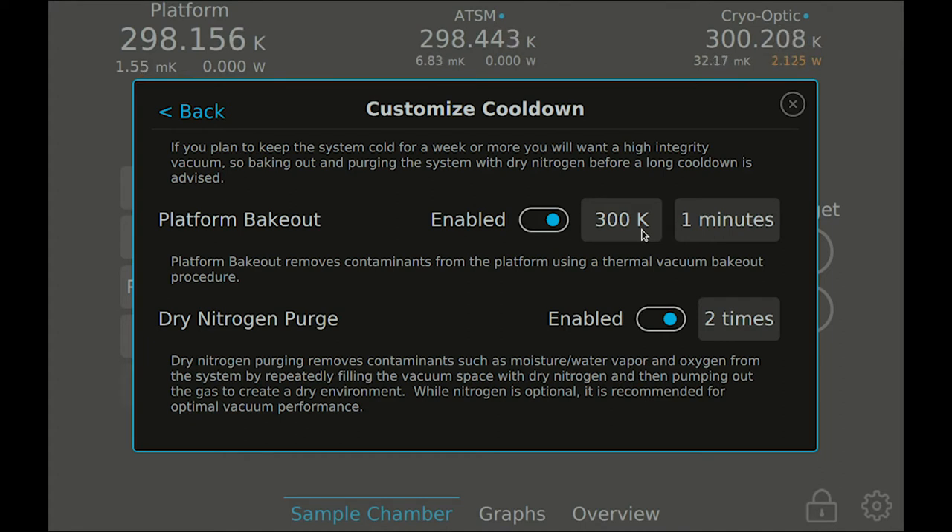The bakeout timer starts once stage 1, stage 2, and the platform have all reached the target temperature. These surfaces are then held at the bakeout temperature for the duration of the bakeout. When enabled, the dry nitrogen purge process will repeatedly pump down and refill the sample chamber with dry nitrogen to help draw contaminants out of the sample chamber. You can set this process to repeat as many times as you'd like. If you don't have dry nitrogen connected to your system, then dry nitrogen purging will be skipped even if it is enabled.